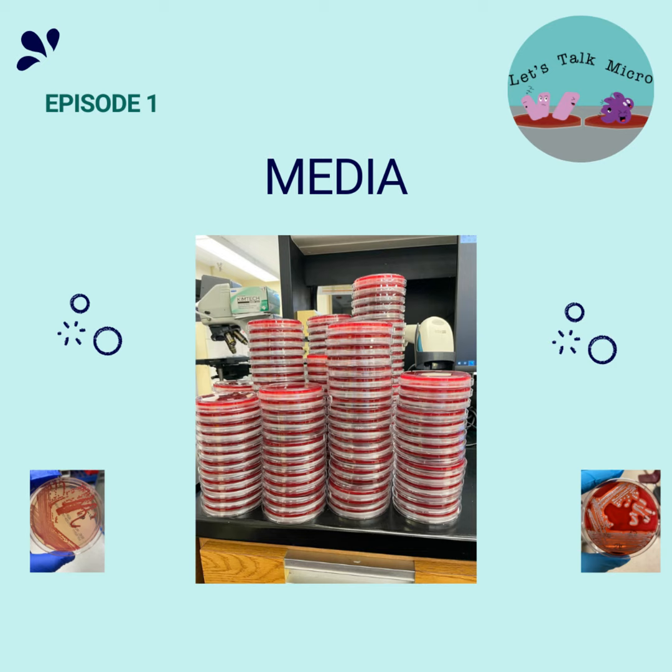Like I said, if you're answering what MacConkey is for, it selects for gram-negative rods. You need to be specific because there are gram-negative rods like Haemophilus or anaerobes that do not grow on MacConkey. And you can actually lose points for that in your test. And not only that, you will be giving the wrong answer. So just be careful when you're going over these.